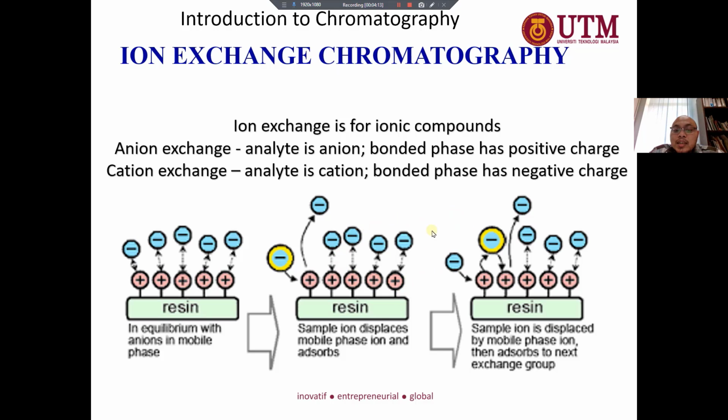Basically, the interaction is that the sample ion displaces the mobile phase ion through the adsorption process. And then the sample ion is displaced by the mobile phase. Then the sample ion will replace the next mobile phase ion. The process is continuous until it reaches the detector.